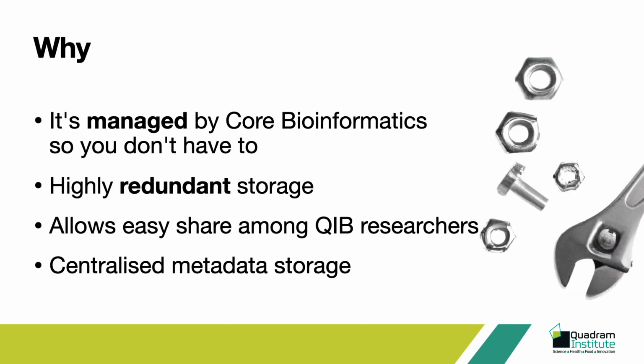IRIDA offers all the advantages of a managed platform, and it's a system with an easy-to-use web interface for easy access by all QIB researchers. At the same time, with command line tools like IRIDA Uploader and IRIDA Linker, you can automate the upload and retrieval of datasets from the command line. IRIDA is essentially like a local reads archive like EBI, ENA, or NCBI SRA, and like those it works better with annotated metadata. Adding metadata to a project is very easy, and this tutorial will cover how to do it.